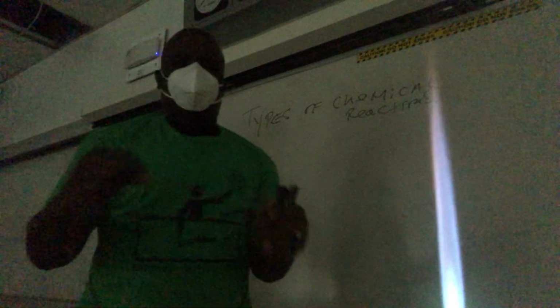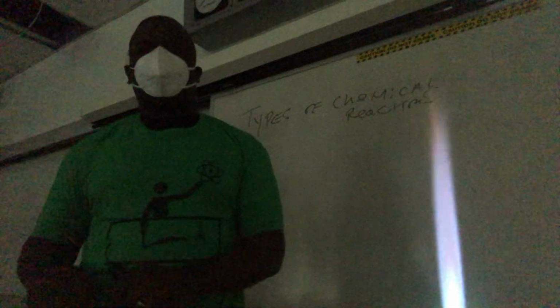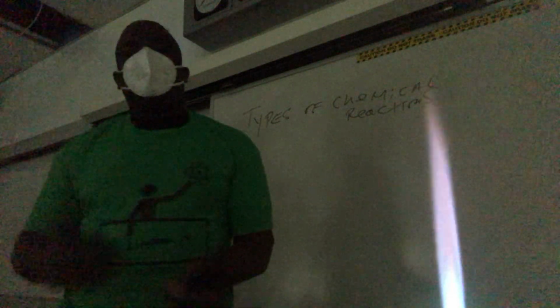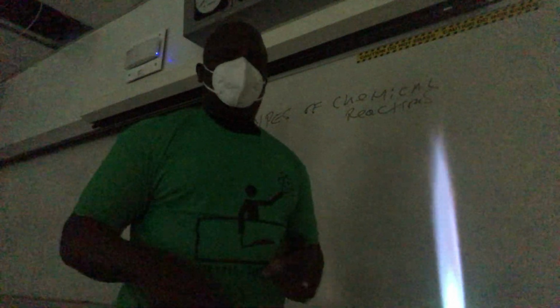I have a magnesium ribbon right here. You've probably seen it before. Probably hard to see. Here you go. All right, the magnesium is an element, right? And what we're simply going to do, guys, is react this element, magnesium, with the other element that we're not seeing right now, oxygen in the air that we breathe, yes? Okay, so here it goes. We place it in the flame.